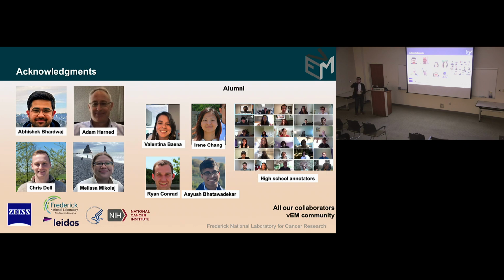For wanting to segment something besides mitochondria, like neurons and neuron processes, something that I was just messing around with a little bit, but having trouble with, is that if I get a model more accurate for the cell bodies, then it messes up on the processes, or vice versa. Do you have any advice for that? Were you using Empanada or something like Voss? I was just trying out various AI models. The answer is likely because of context. Your cell body is like asking a model to get both a tree trunk as well as a twig.